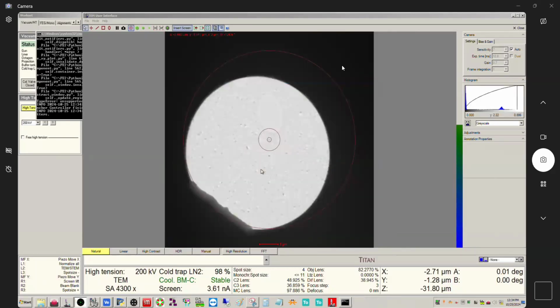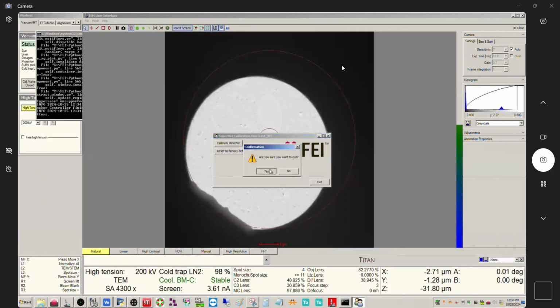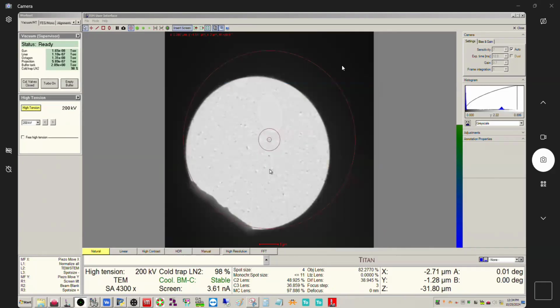Okay. And we're good. Oh, and I forgot to tweak the height, but that's okay. You weren't off by that much. So again, that has nothing to do with the X-ray energies, right? It may have affected the collection efficiency, but no big deal.